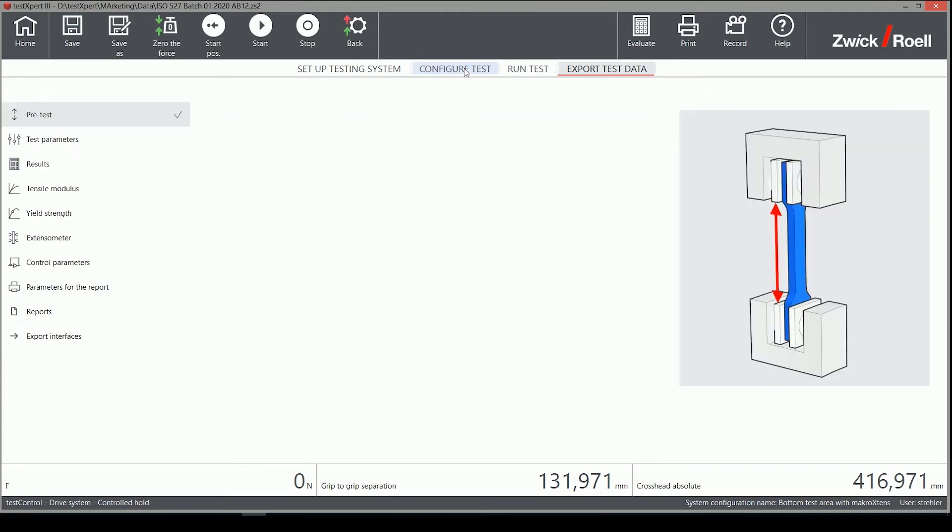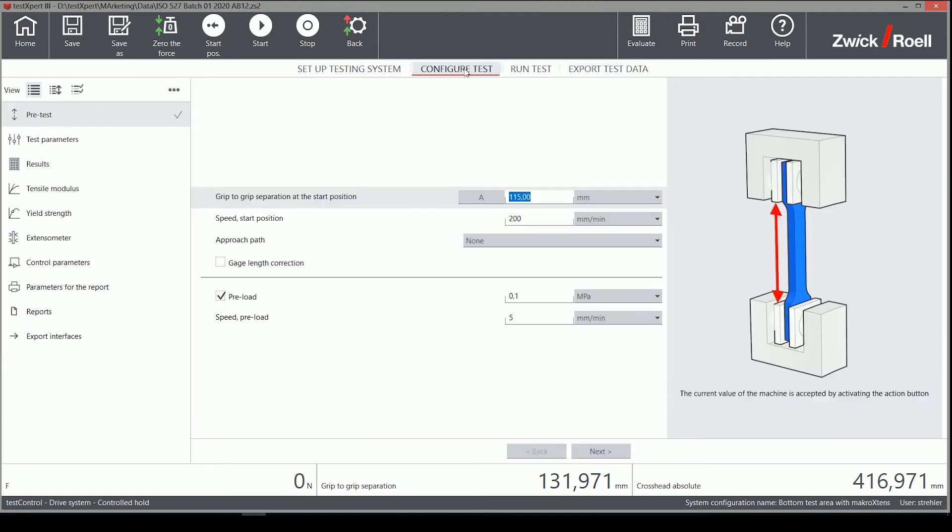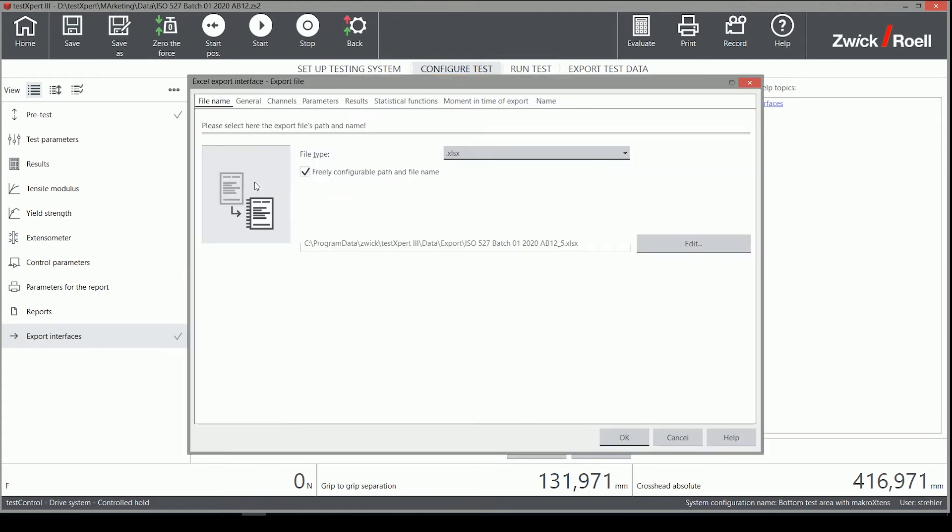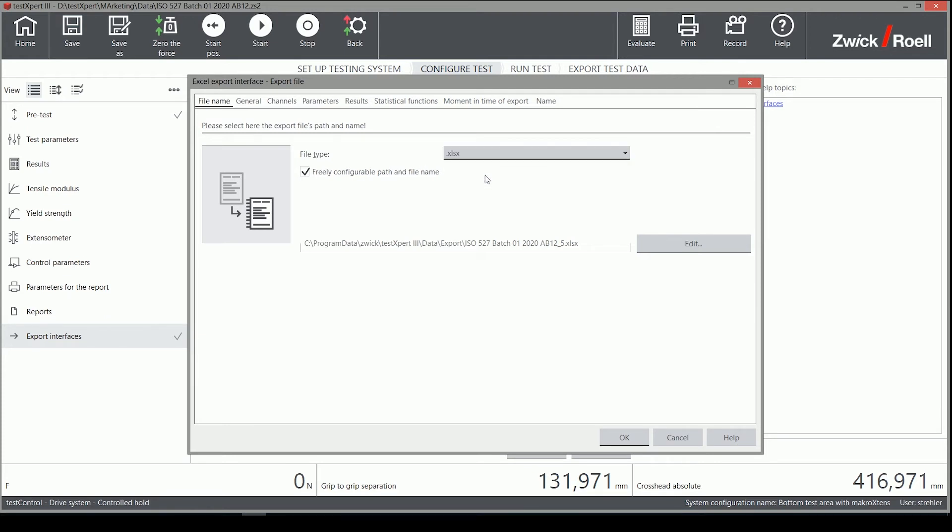Now, I will demonstrate how the Excel export can be customized if you need different data. I select the default Excel export and select the edit function with the right mouse button. On the first tab, we can define the file name and Excel format.